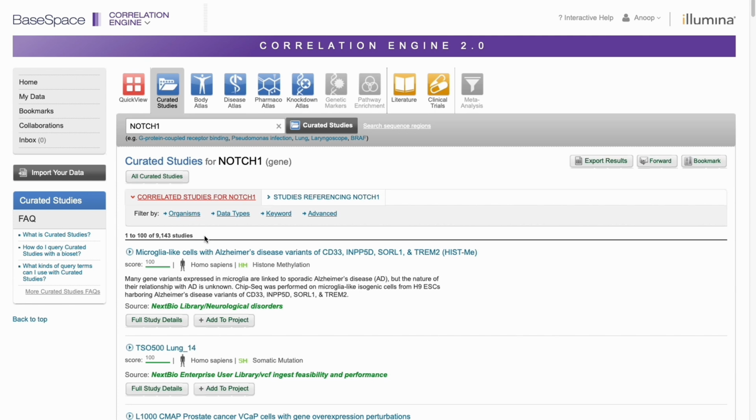To this end, let's examine the representation of genes in PubMed and Correlation Engine. Comparing their representation allows us to understand how the results may vary based on what's already understood about them. It's possible, for instance, that genes that are poorly understood based on their representation in the literature may also be poorly represented as significant results in omics studies. Let's find out.